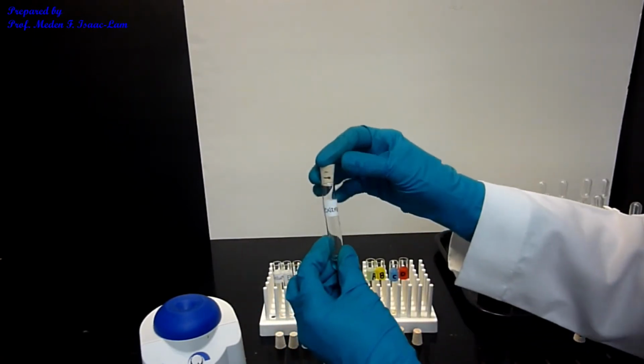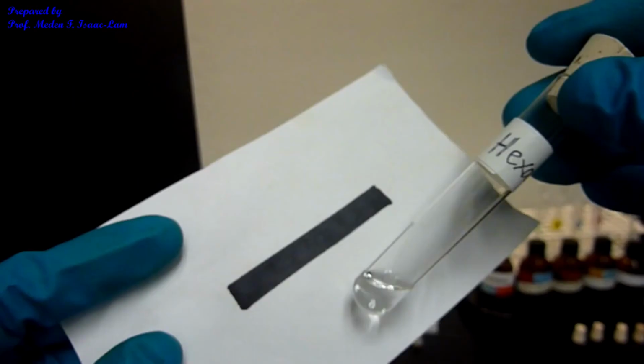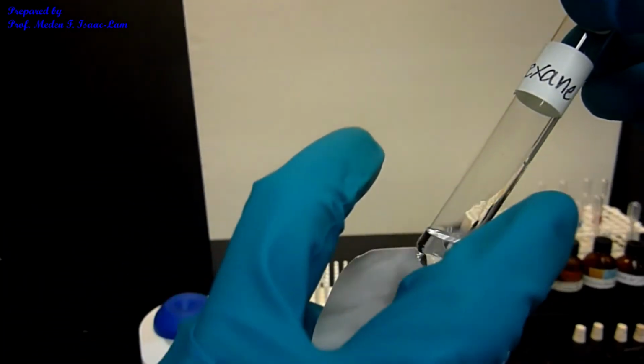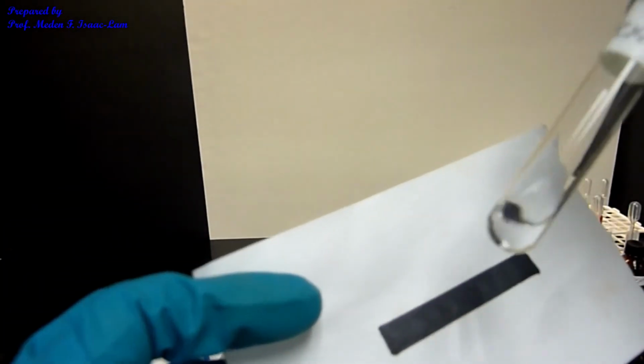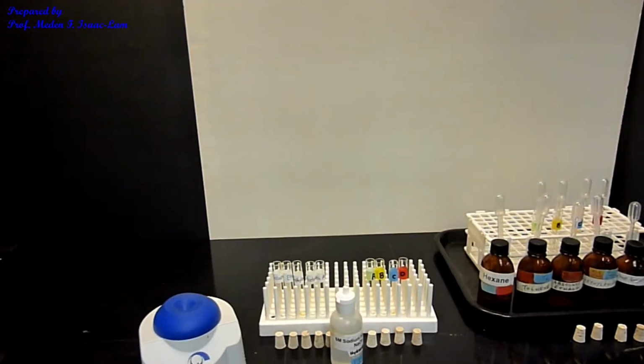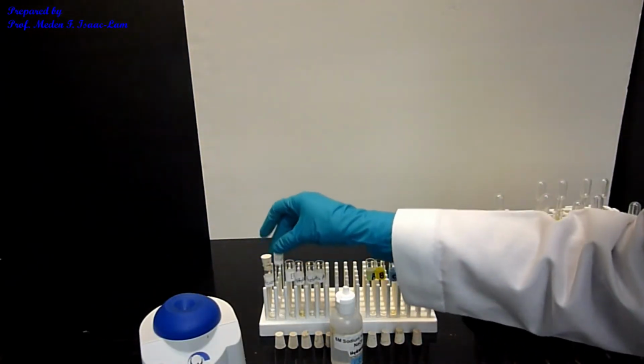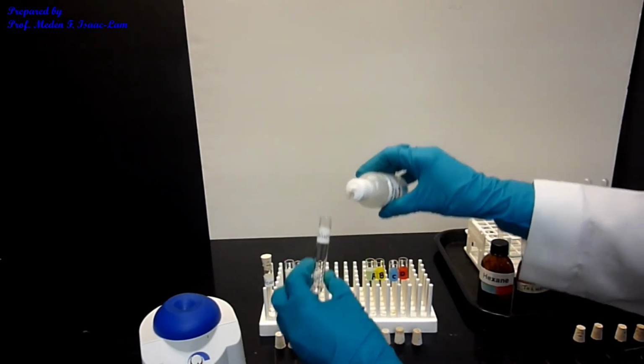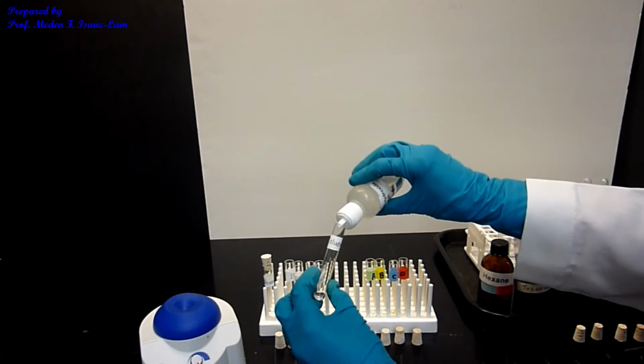Cap it. And then, so I don't see any activity for the hexane. I see some droplets here on the side. Okay, so that's hexane. And then now toluene. So again, 8 drops.